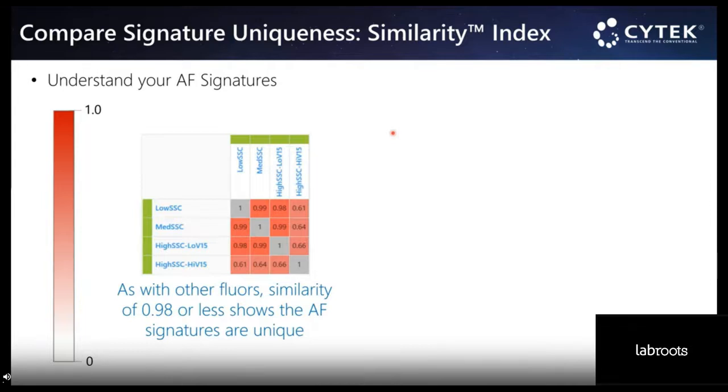You don't really need to go and do all that exploration on your own, looking at the signatures. There is a way to do it on the software. On the software, you can calculate a metric called similarity index. Cytek defined this metric to understand how similar 2 signatures are. The similarity index goes from 0, no similarity, to 1, identical, and that number can be calculated on the software.